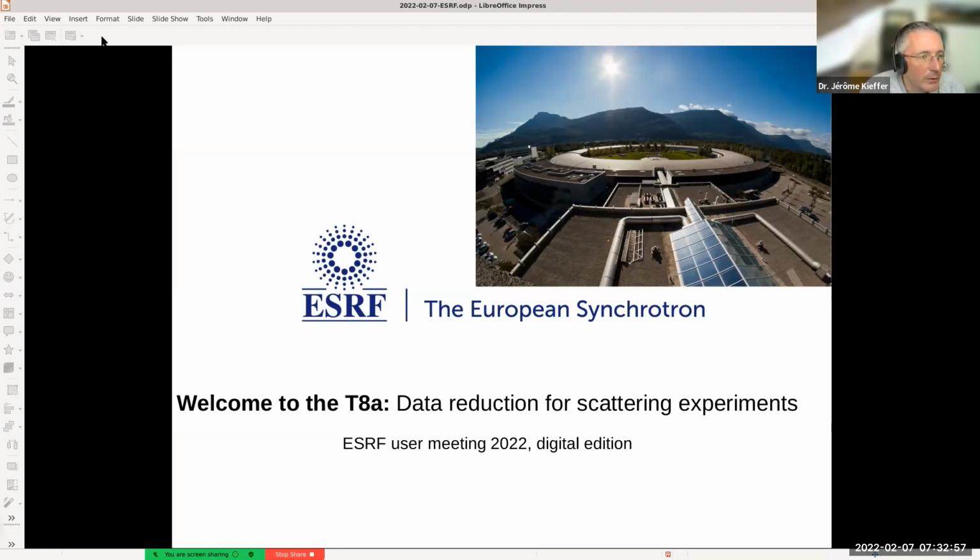So that's one application. The second application is to extend this further, but instead of recording the background, we like to record the Bragg peaks, and this has an application for serial crystallography, at least in the way it's performed. It will be performed at ESRF on the beamline. So I'll present you the ID29 beamline. And the last part is about the processing of serial crystallography data.